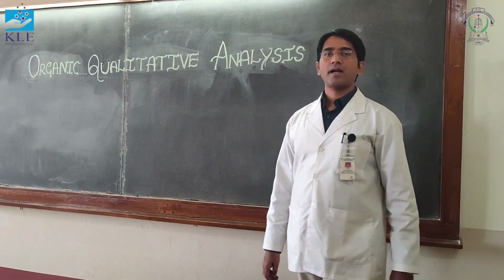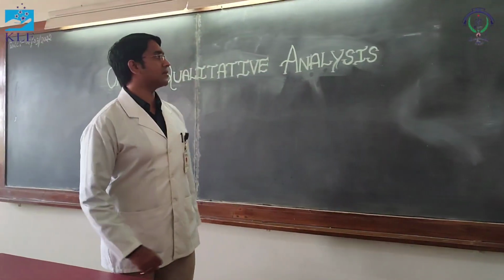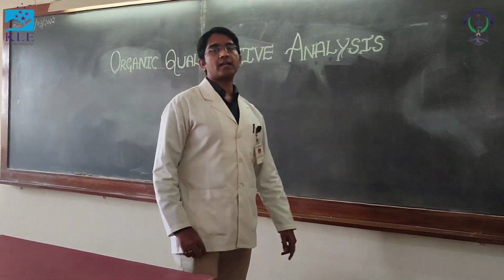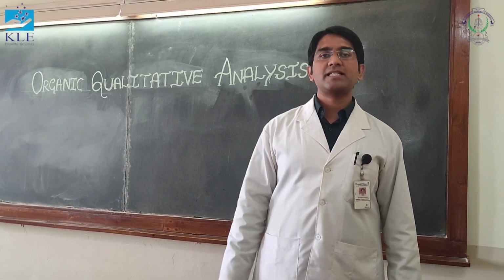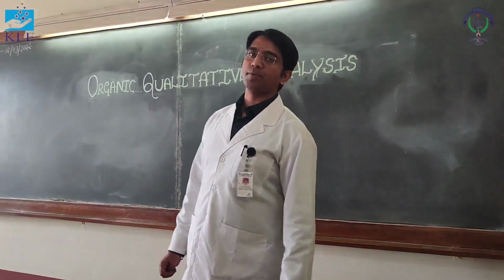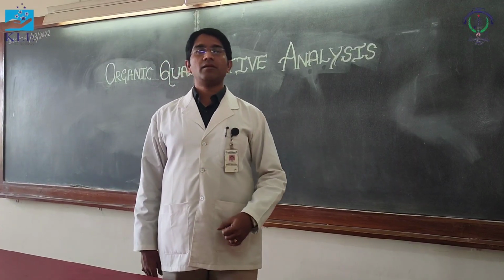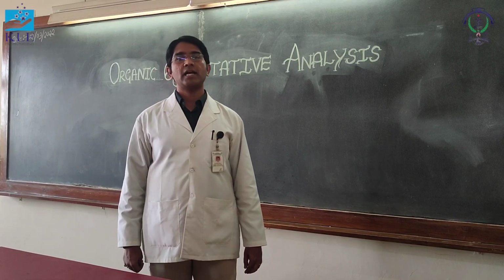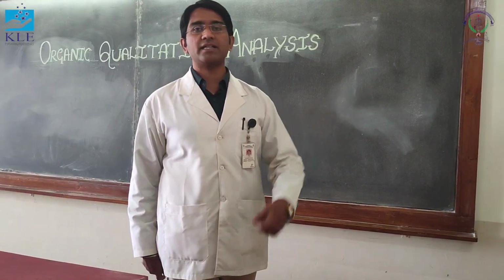Today my students and I are trying to provide you with insights into the organic qualitative analysis tests which we carry out in order to find out what type of sample is given to us, that is, whether it is an acid or an amine type of compound, or an aldehyde or a ketone. To give a little more insight and the information associated with that, I will call my student Anusha for giving the details.